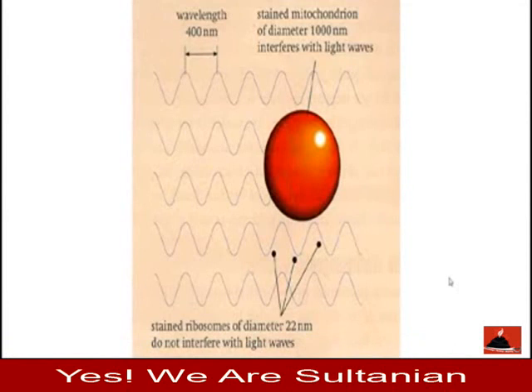Free electrons behave like electromagnetic radiation, and when a metal is heated sufficiently, some of its electrons gain so much energy that they can escape their orbits, and they have a very short wavelength. A beam of electrons has a very short wavelength, about 2 to 12 picometers. That's 1,000 times smaller again than nano, and the greater the energy of the electrons, the smaller it is. That's what determines whether they're down at the 2 picometer or up at the 12 picometer end. In both cases, we're looking at a wavelength so short that we're going to be able to see structures that are very, very small.